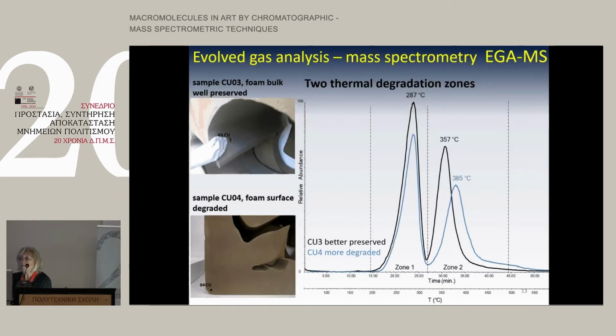So we have taken very thin samples from the inside and outside of this sculpture, and the inside was less degraded, and the outside was quite degraded.